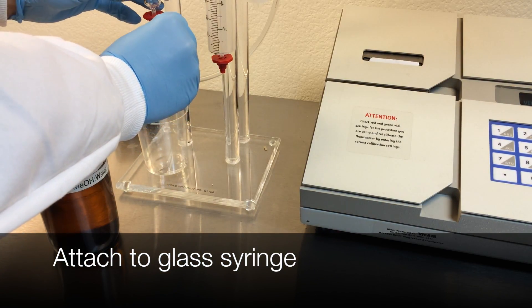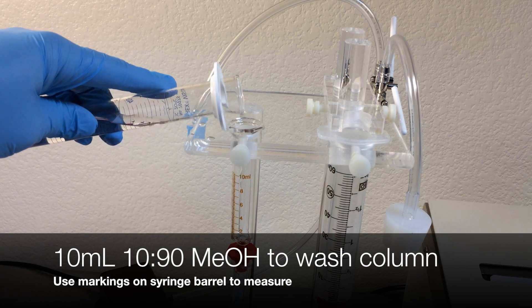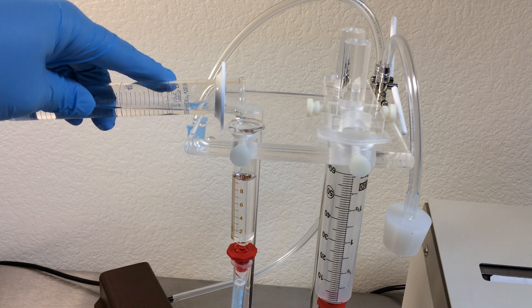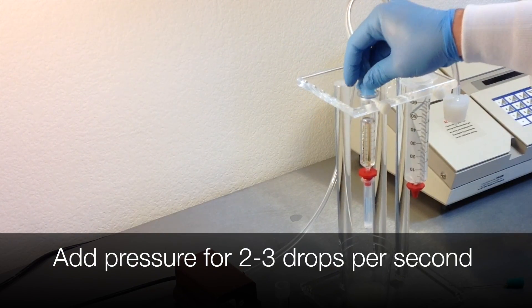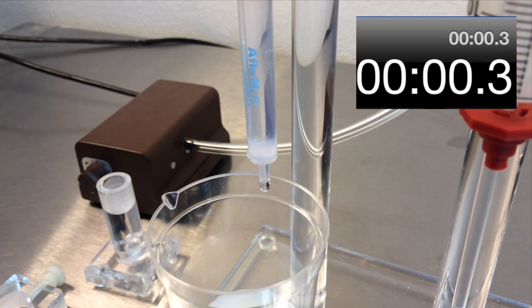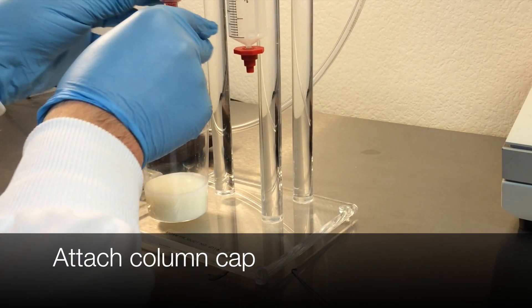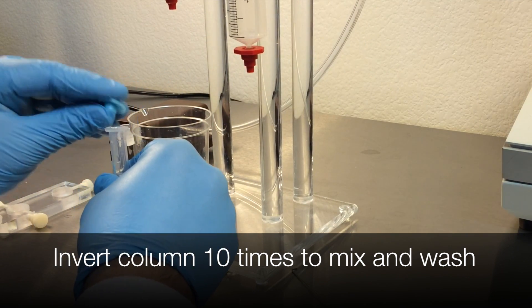Attach the column to the glass syringe barrel. Use the markings on the side of the syringe barrel to measure 10 milliliters of 10-90 methanol water solution. Add pressure and pass two to three drops per second through the barrel. Pass the solution through the column until the level is approximately one inch above the top of the resin bed. Remove the column from the syringe barrel and cap it with the cap that comes with the column. Invert the column 10 times until the resin beads are completely washed from the column bottom frit.